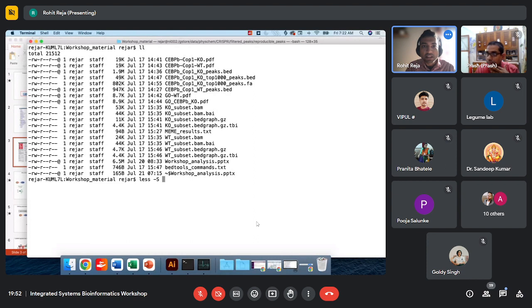Did I? Maybe I did not put the blacklist regions. Let's see.